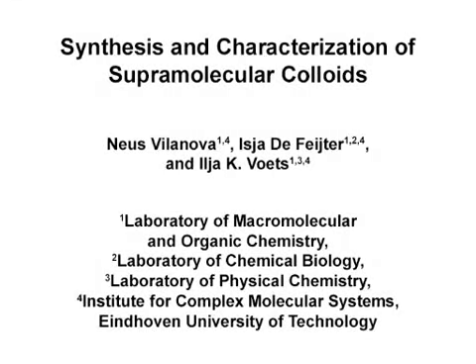The overall goal of this protocol is to describe how to direct colloidal self-assembly by anchoring supramolecular moieties onto the colloids, whose interactions are strong, directional, and reversible. This method can help to answer key questions in the material science field, such as how to accurately control the colloidal self-assembly to create complex and mesostructured materials with interesting properties.